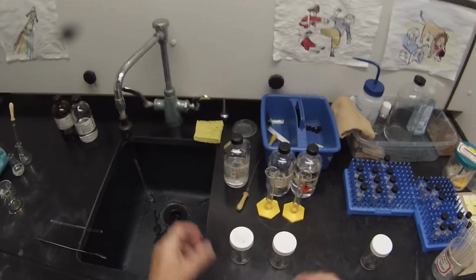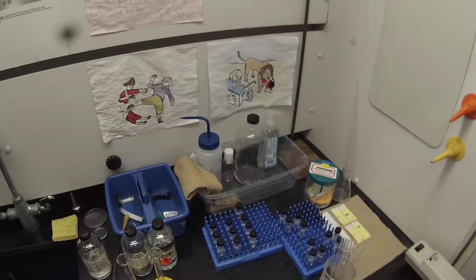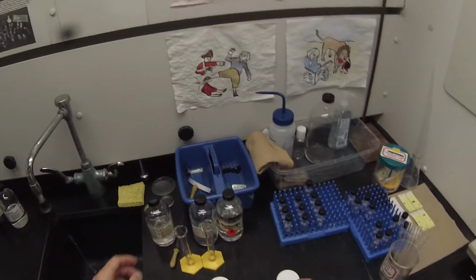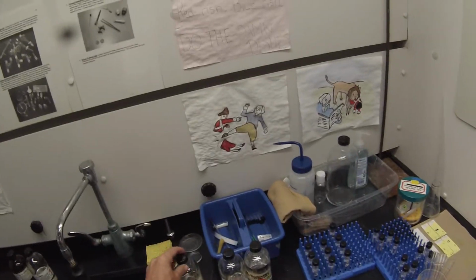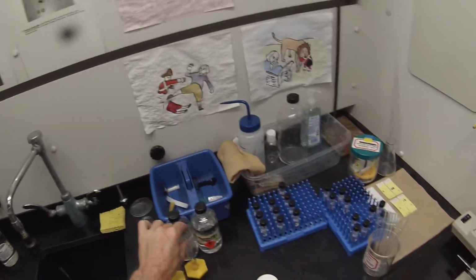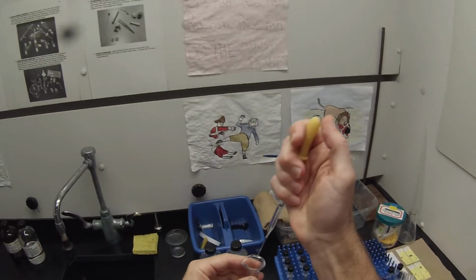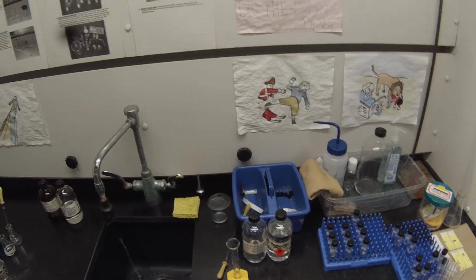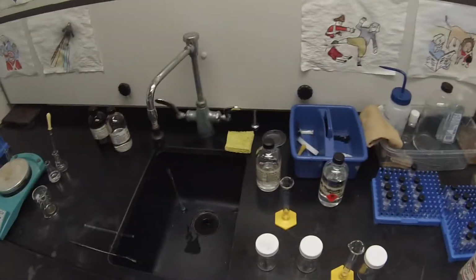So I've got a solvent system for vanillin, which is 3-to-1 hexane ethyl acetate, and a solvent system for cinnamic acid, which is 7-to-1 petroleum ether ethyl acetate. For tryptamine, because it's an amine and has hydrogen bond donors in addition to hydrogen bond acceptors, that tends to stick pretty tightly to silica. So an ethyl acetate petroleum ether mixture would probably need to be quite polar. So for the tryptamine, I'm going to try a 1-to-1 mixture and see if that's good enough. So we'll put 2 milliliters of ethyl acetate in. And then we'll add 2 milliliters of petroleum ether. Make that up to the 4 milliliter mark, which will be a good amount for our chamber.